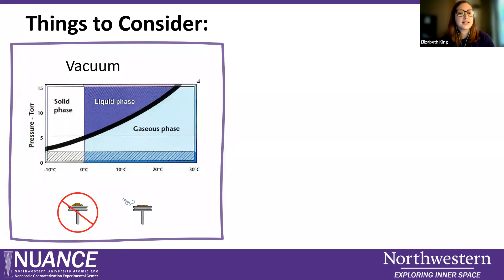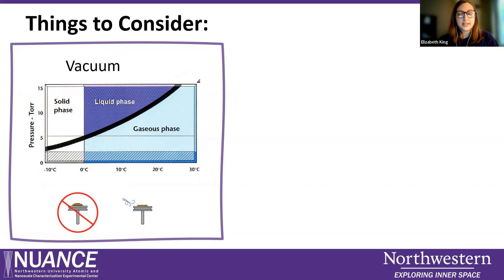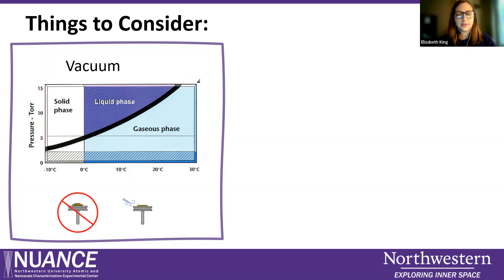Another really common question I get is about powders. When you are putting powders on the pin stub, how do you do that without contaminating the chamber or losing your sample? Our best advice is that you really need very little of your powder to get a good image in the SEM. So put as little as you can, then use either a bulb, a nitrogen gun, compressed air, or something like that and blow off the excess. That way there's no excess powder to escape from the adhesive and get into the chamber.